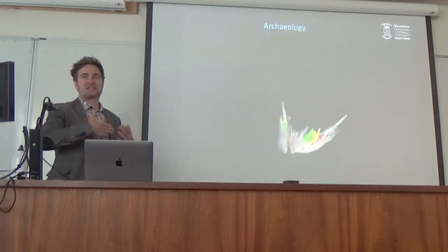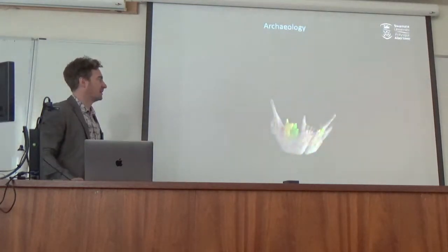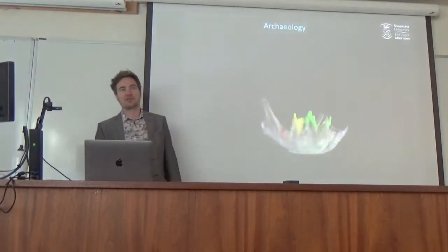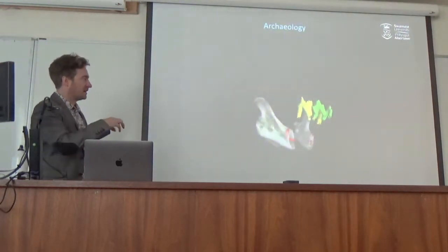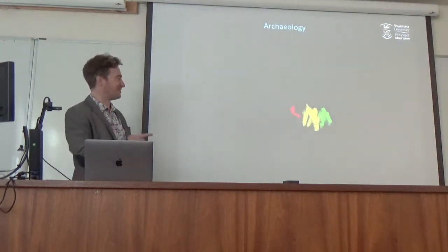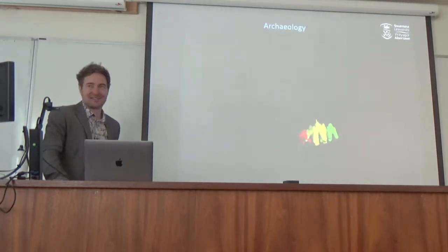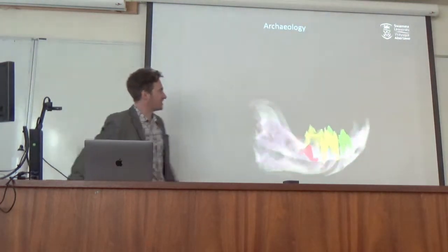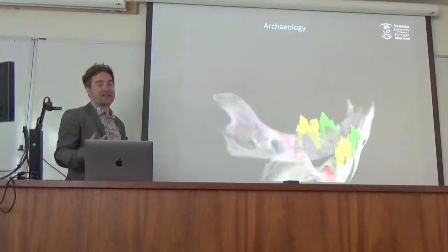It was slice data that gave me that, and I was the person manipulating that in all three orientations. So I segmented out the teeth, and this indicates a much younger cat than we initially thought, because the teeth are unerupted, so this could be a cat up to around 6 weeks old. There was a talk yesterday on segmenting of teeth, and I did this manually, which was horrific, because they look pretty much the same as the bone, apart from the enamel. So it's a bit sketchy, some of the segmentation, but it was enough to show unerupted, smaller teeth of a kitten, effectively.